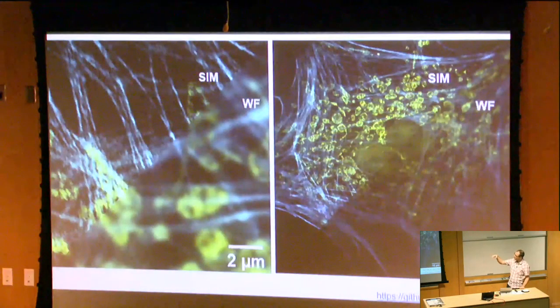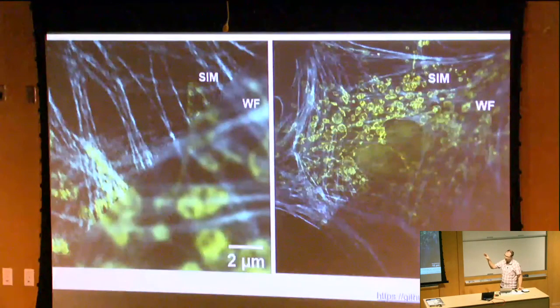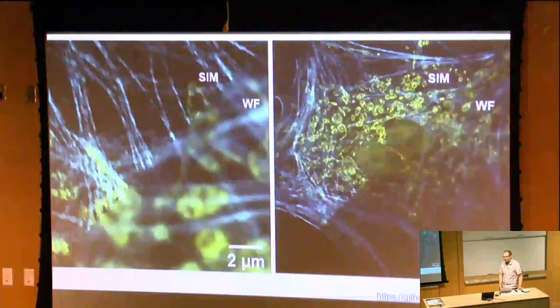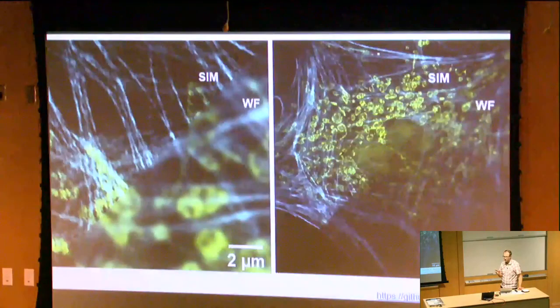In this case, where we're just interested in continuous features, we don't have to have that assumption, basically. But for the localization work, it's much easier if they're slightly separated. If they're not, how do you count individuals at that point? It becomes a really hard problem. So we just cross our fingers and deal with it when it's not.